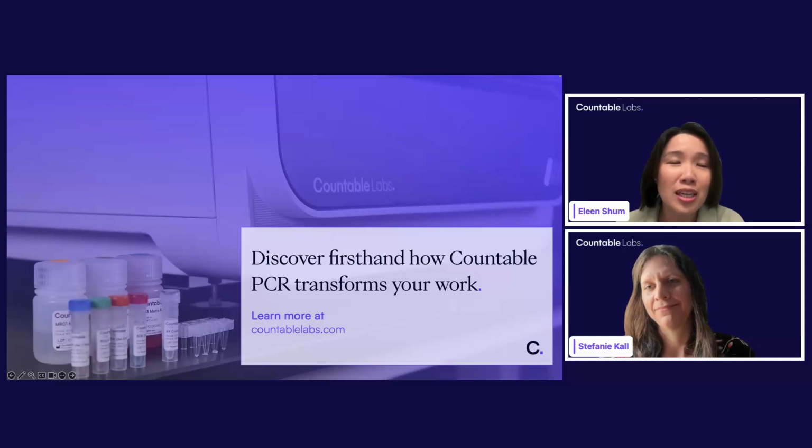Typically, gDNA extracted from commercially available kits works really well in our system. Some folks like to pre-digest because of secondary structures that would lead to undercounting, or because they want to look at concatemers right next to each other, so they either cut it or don't. It depends on your application, and you can do both.